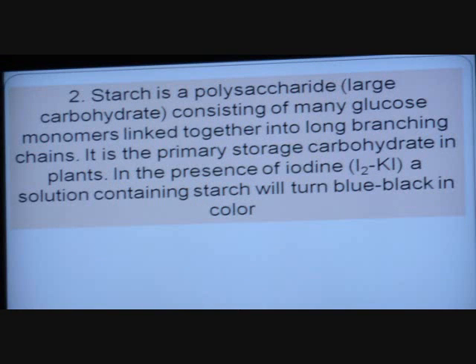All right. Something about starch that makes it detectable. It's a great big old molecule. It's a polysaccharide. And actually, it's just composed of tons of glucoses hooked together. But they branch and branch and branch and branch, and that's what makes it detectable. This won't detect glucose by itself. Only when glucose is chained together in large chains, it's going to turn really dark black.